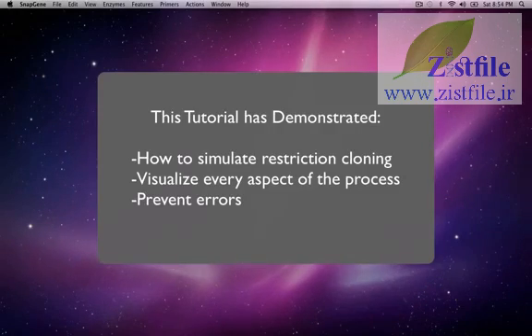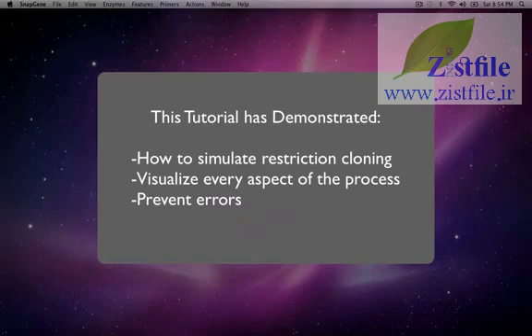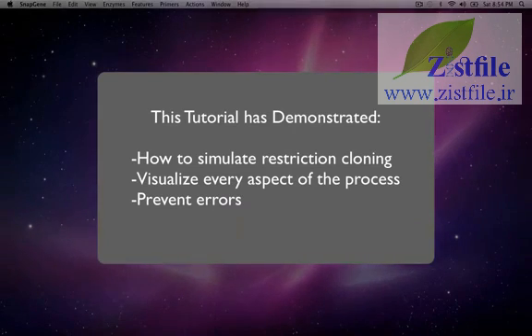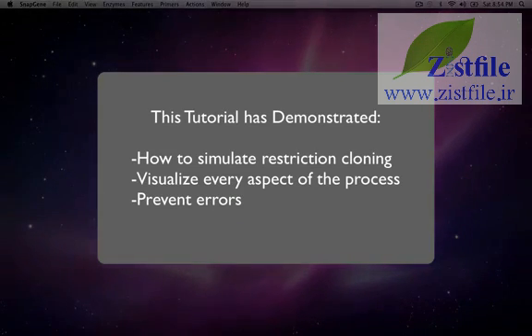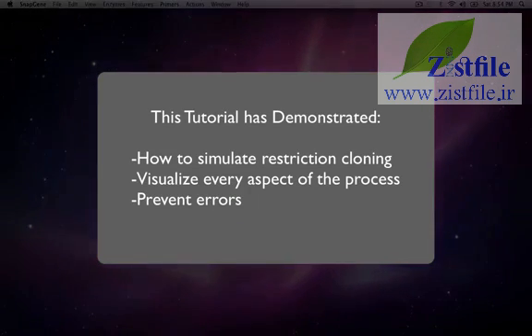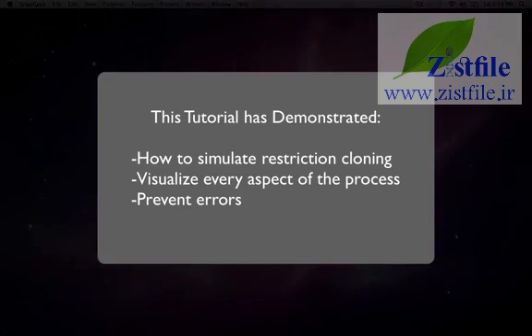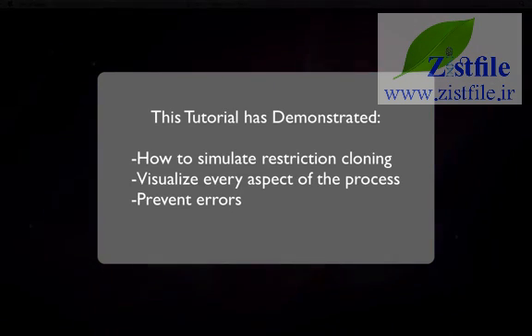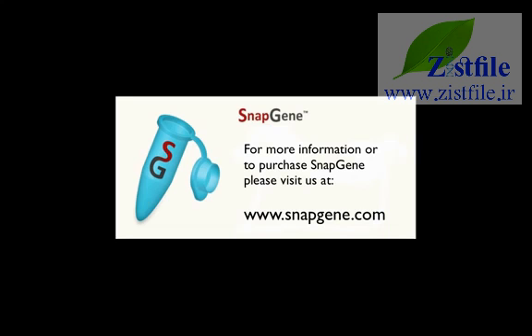This tutorial has illustrated how SnapGene can simulate restriction cloning while helping you to visualize every aspect of the process, including error prevention. In these examples, I, as the researcher, knew what I wanted to do, and SnapGene helped me to get there quickly. But the restriction cloning controls are equally useful when you want to design a new cloning strategy. Thanks for your attention.